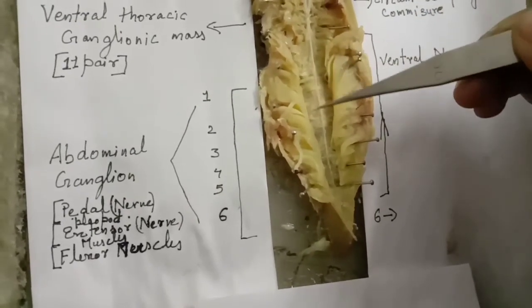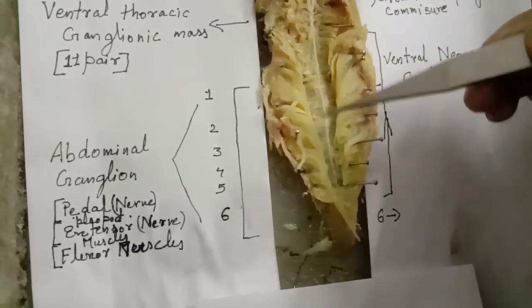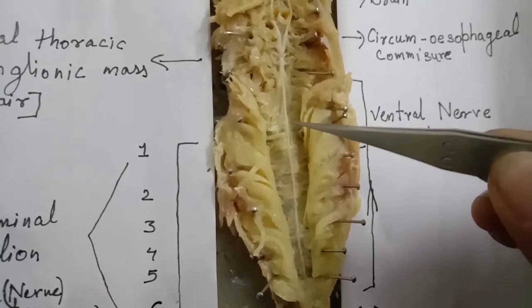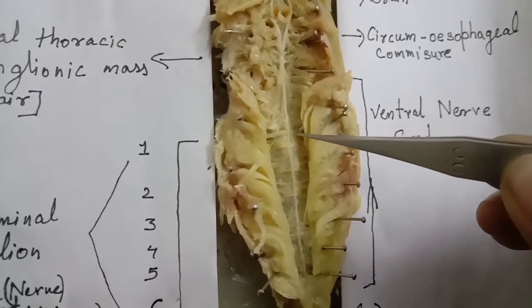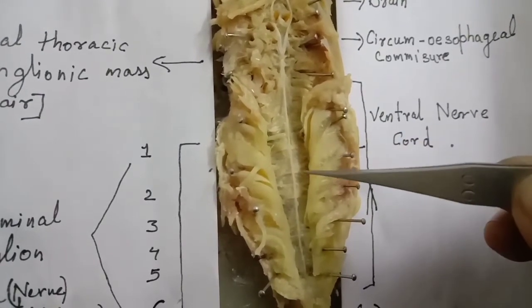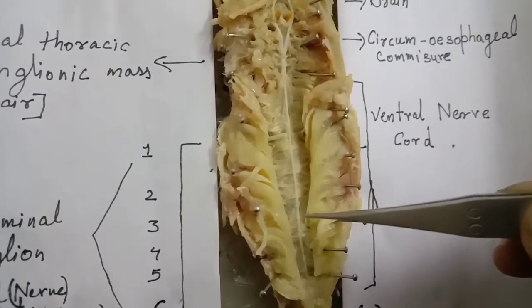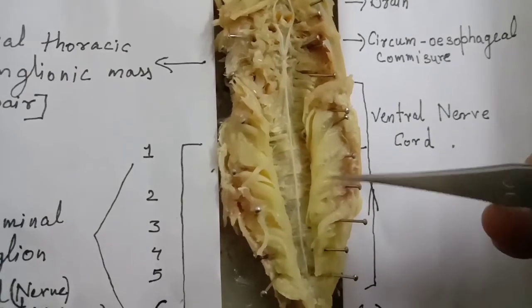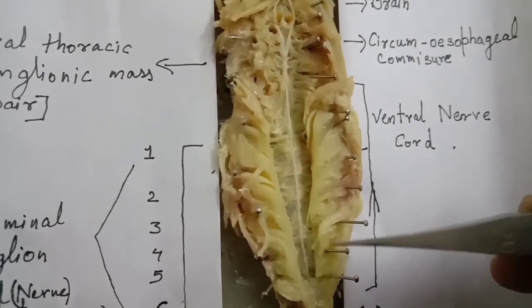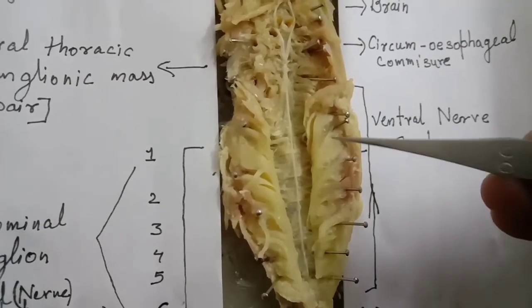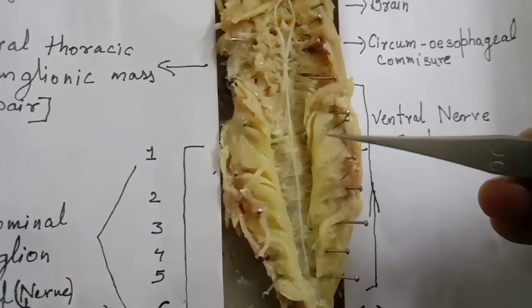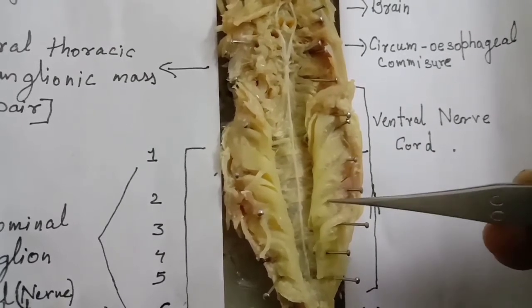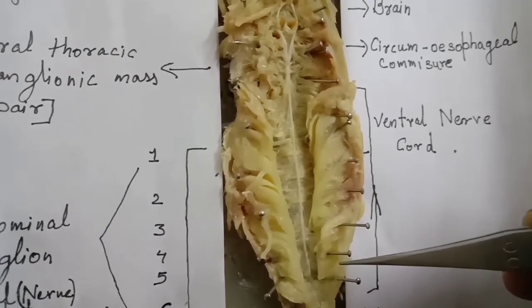Next is the ventral nerve cord. It lies in the midventral line in the abdominal region. There are six abdominal ganglia which give rise to nerves supplying the appendages, muscles, uropods, and hindgut.